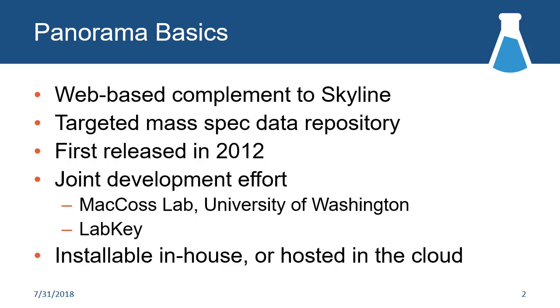You think of it as a data repository. You can put all your data in there. You can organize it in different ways. You can share it with folks internal to your lab, external collaborators, or make it public. You can choose who gets to do what.